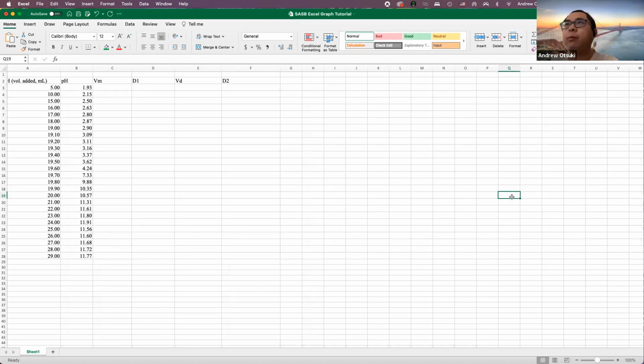So I know the first lab, no, sorry, not the first lab, the first titration experiment, things went a little rough. Probably things didn't go as planned, and that's okay. I mean, you only had measuring out water the previous week, so it was kind of hard to expect everyone to ace this experiment. That would have been the goal, if everything went smoothly. But oftentimes in chem lab, that's not the case. So we have to kind of just be prepared for that.